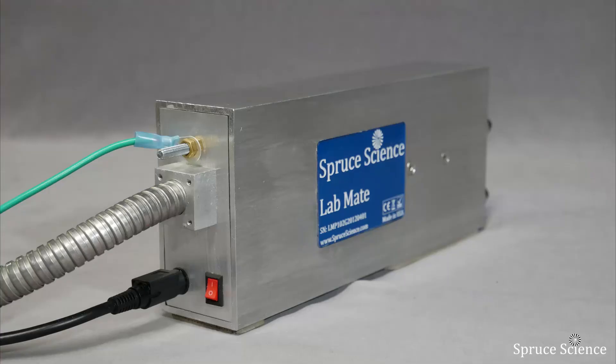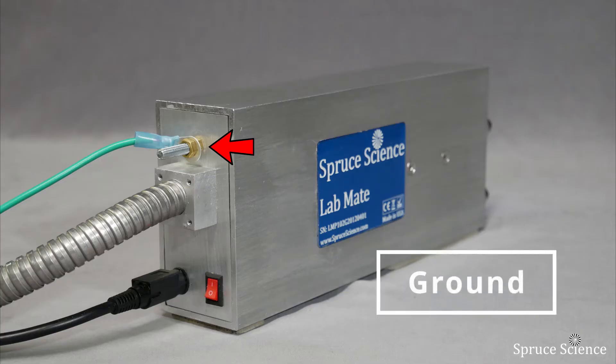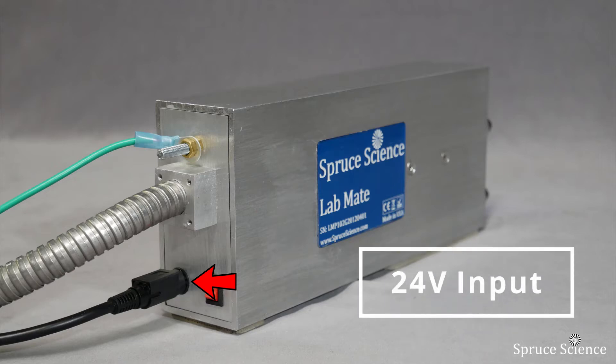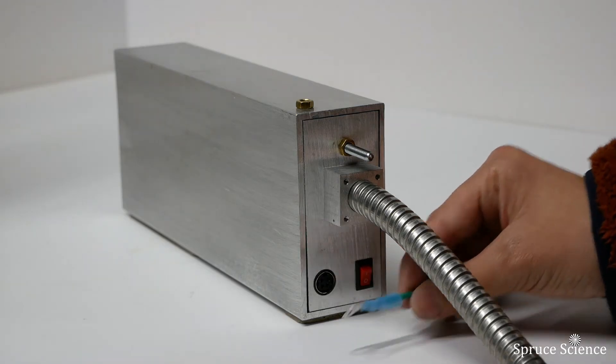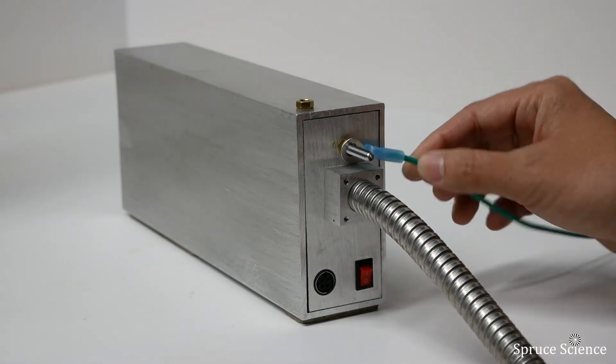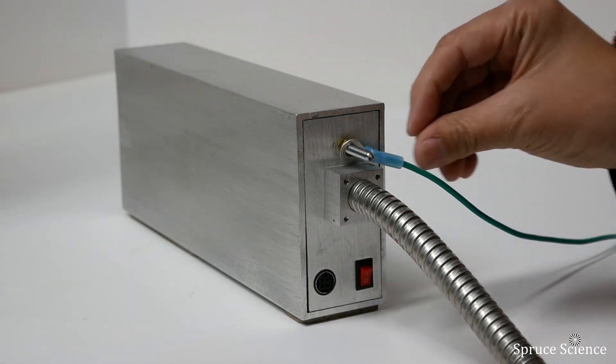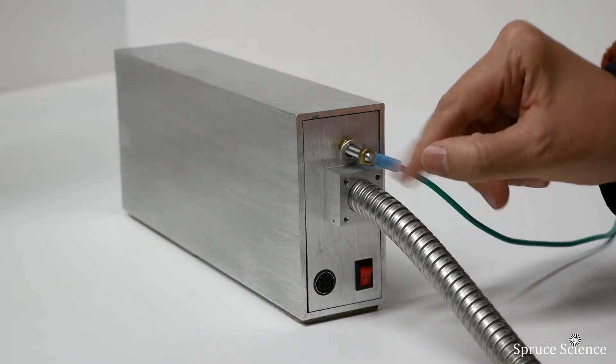On the back of the generator you will find M5 threaded stud for grounding, main power on-off switch, DC input connector, and high voltage output connector. Now that we have gone over the basics of the high voltage power supply, let's complete the setup by going over the high voltage connection.